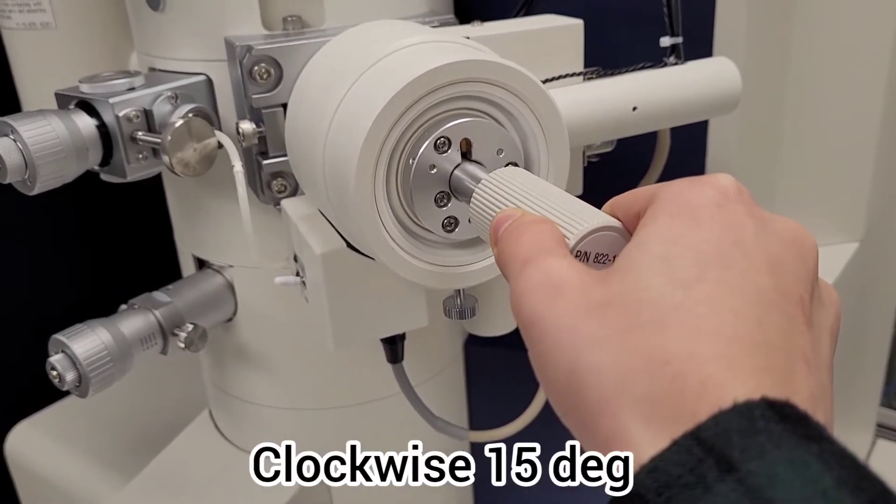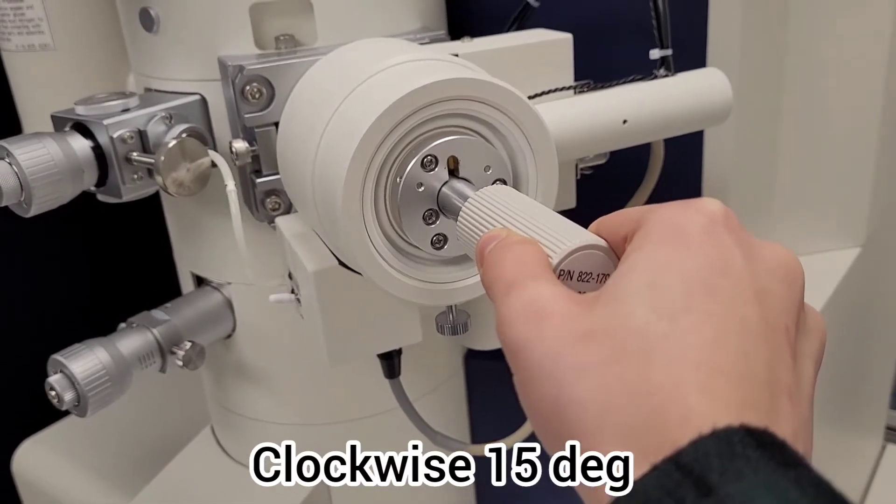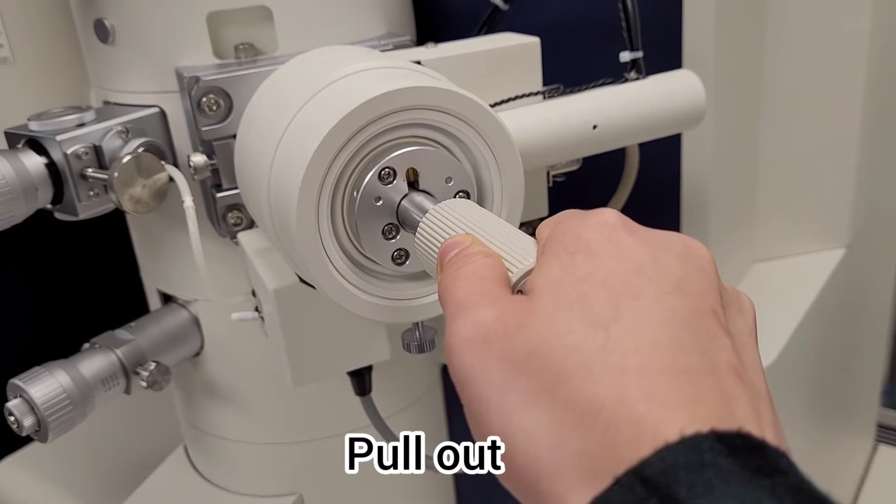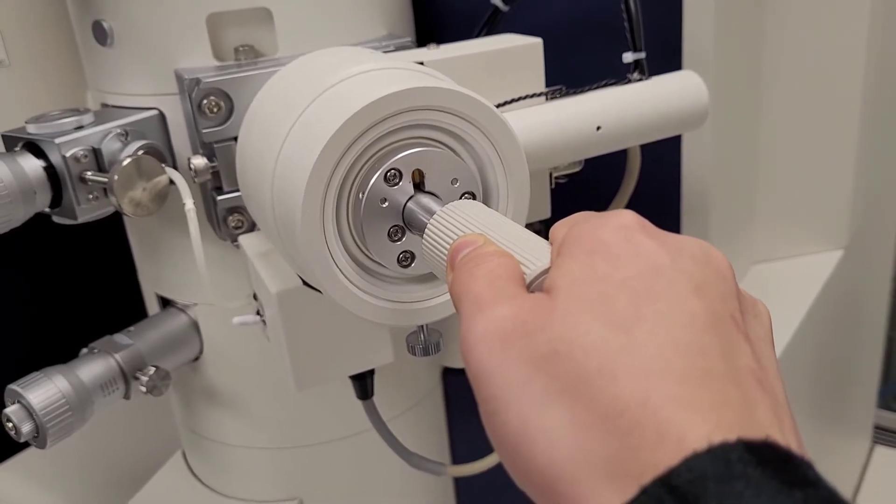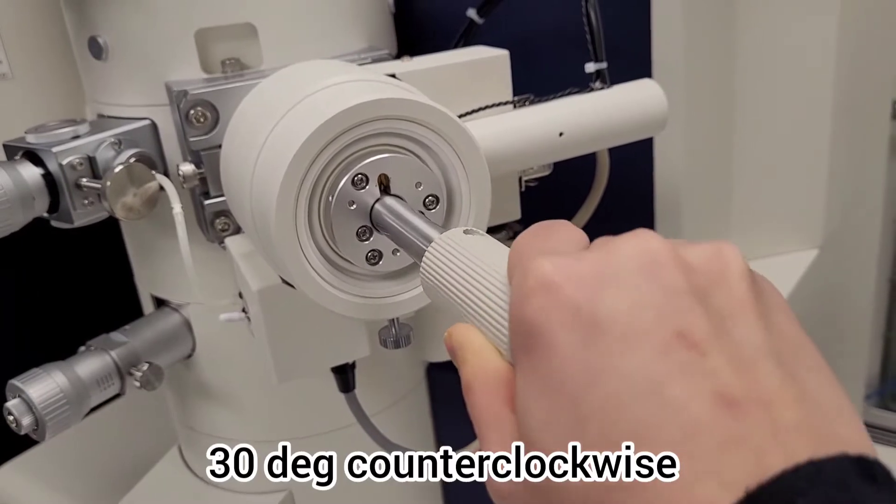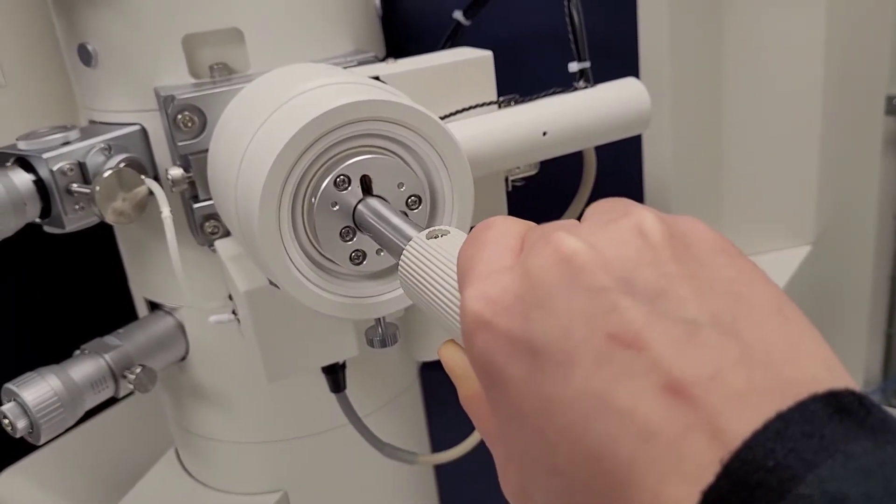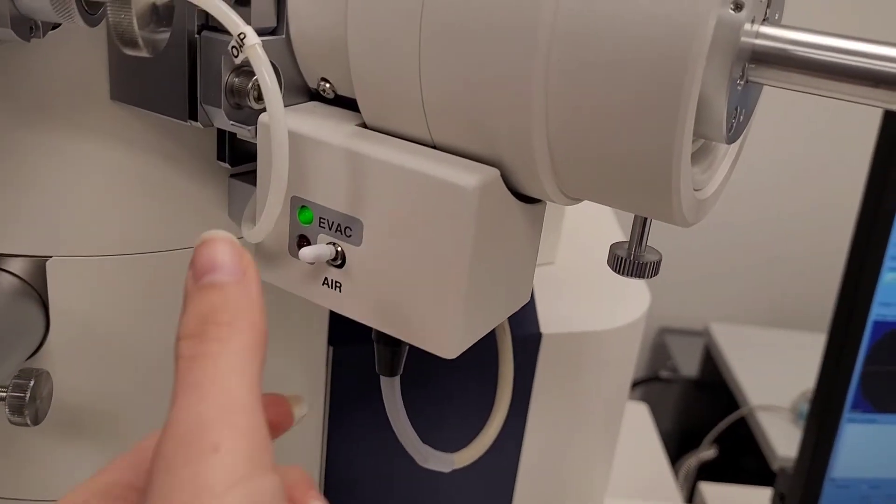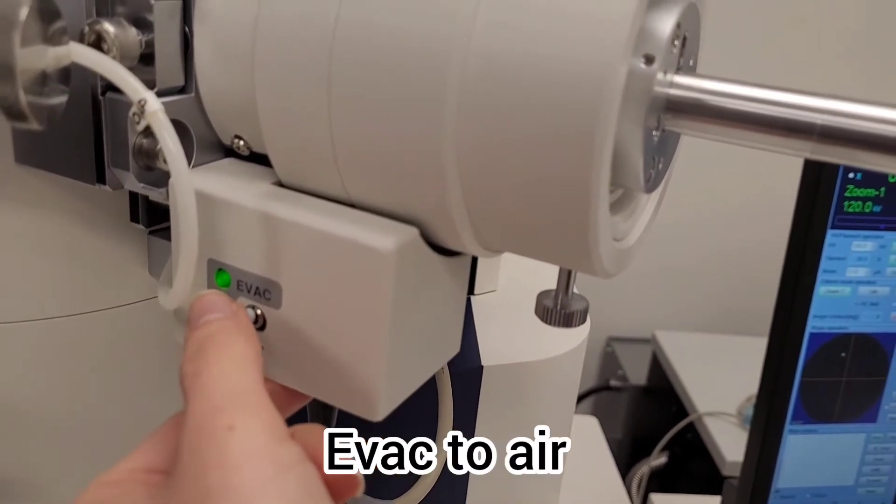Turn it clockwise 15 degrees, then pull it out again, and then turn it counterclockwise by 30 degrees. Pull out the probe again until it stops. Then set the EVAC switch to air.